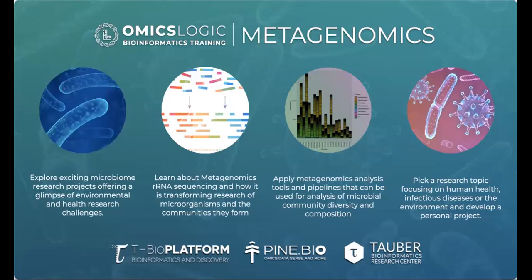So to give you a sense of purpose, and to make you familiar with what is being studied and what the general trend is using this data type. For the most part, we will be focusing on the bioinformatics part related to metagenomics data analysis, and we will cover some of the main aspects of metagenomics sequencing analysis of 16S rRNA, and how these are applied to answer some of the key microbiology research questions using data analysis.